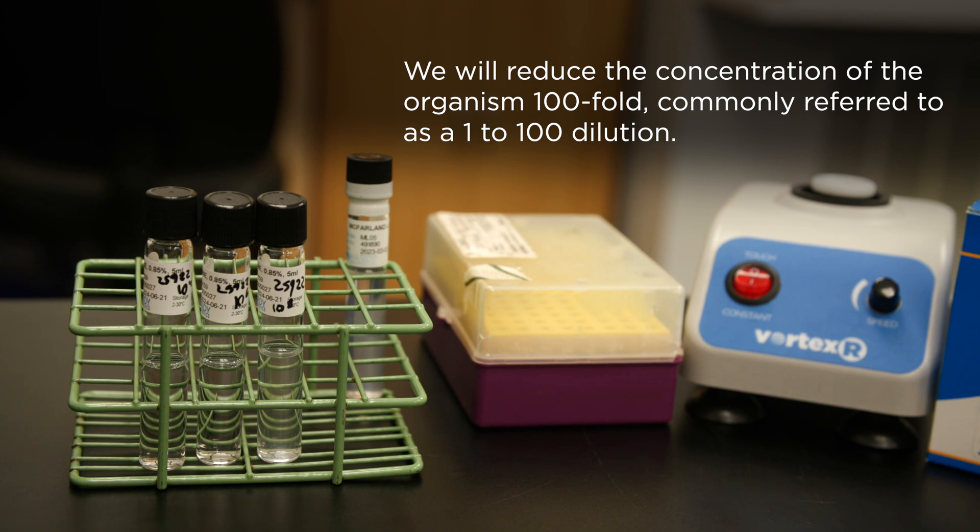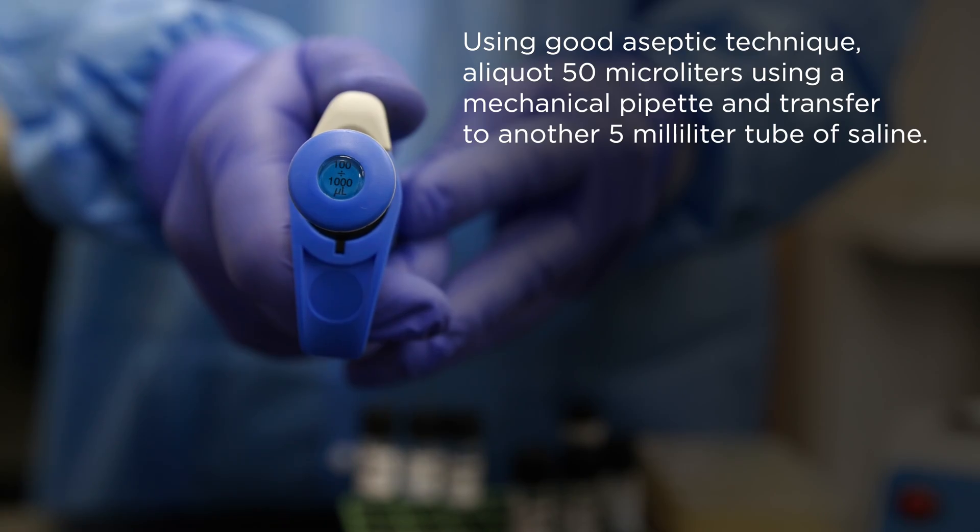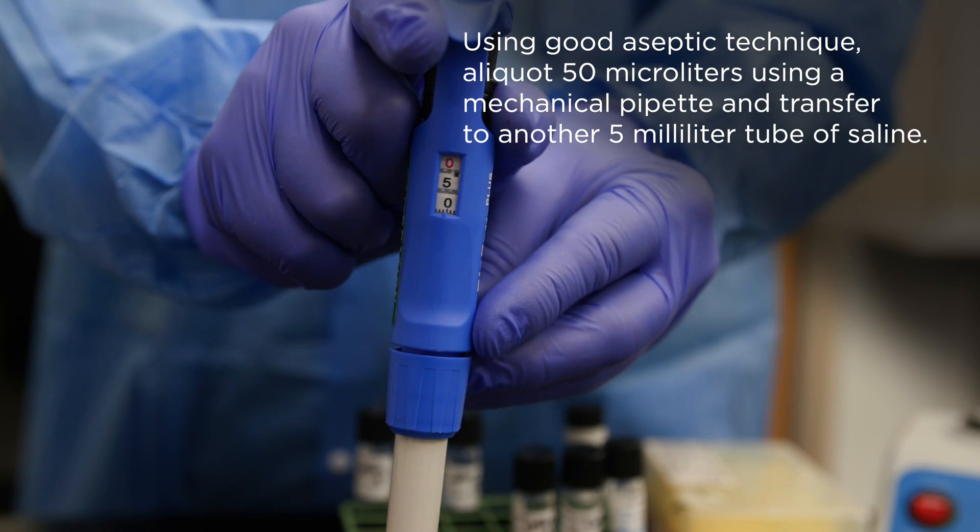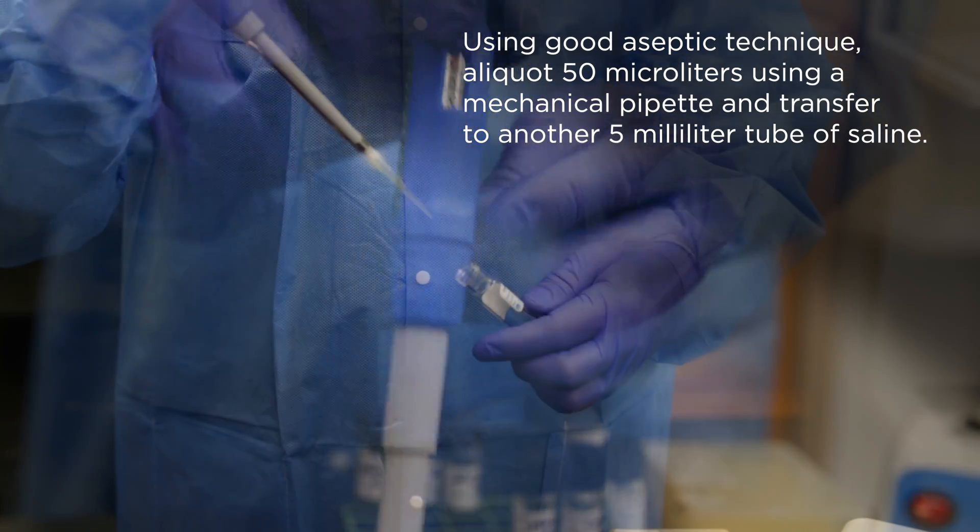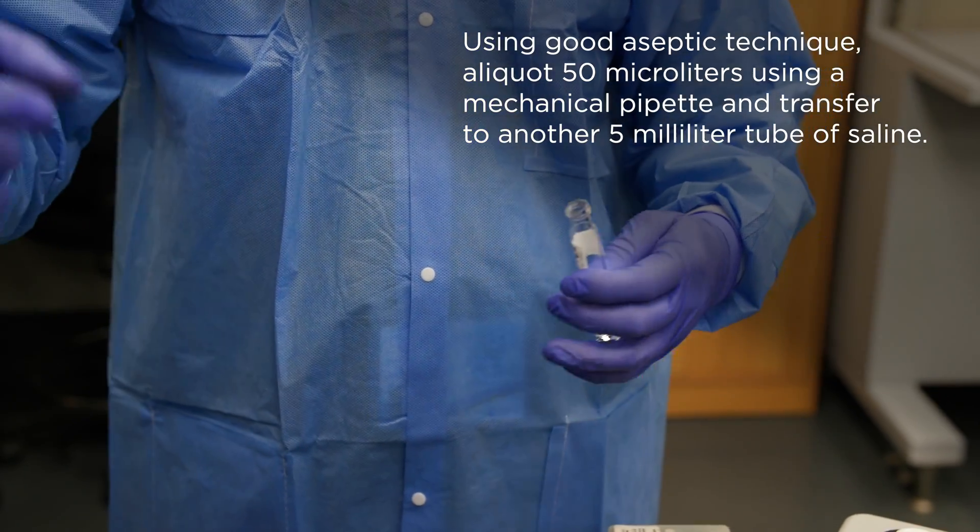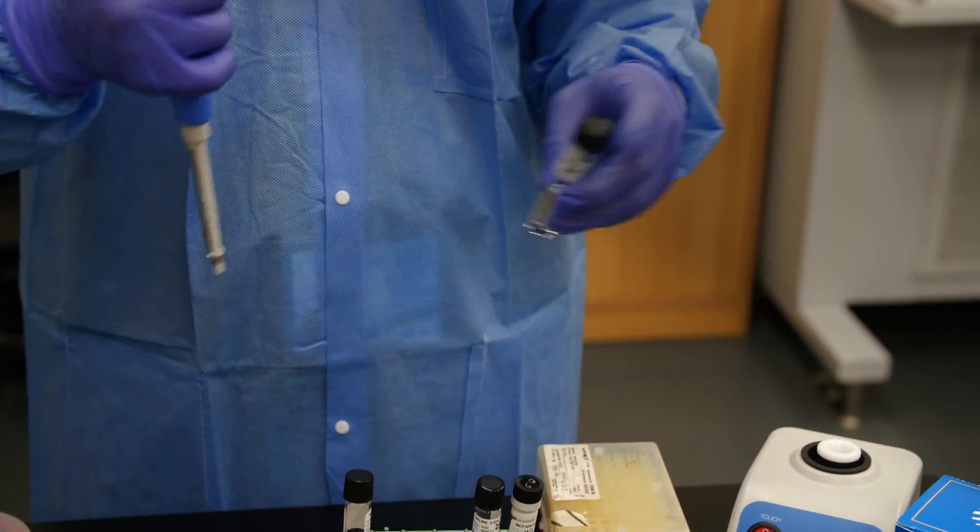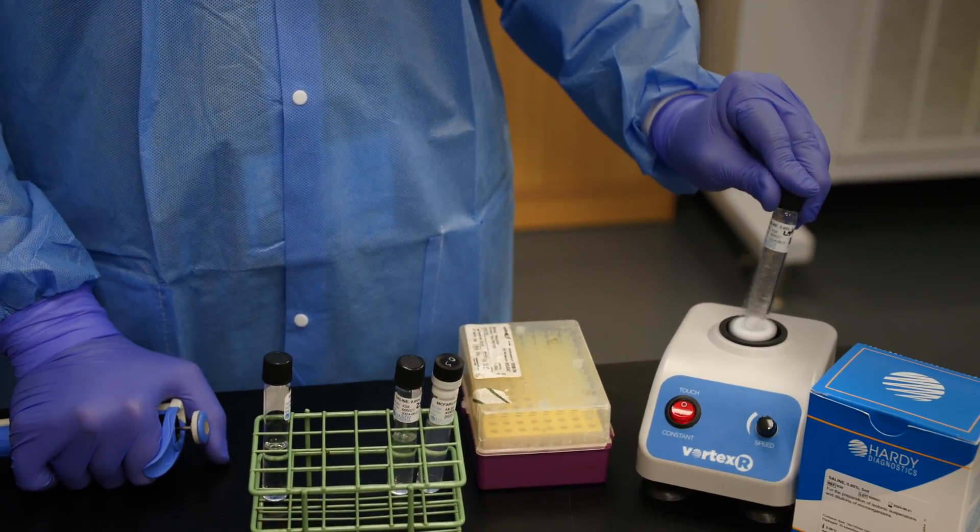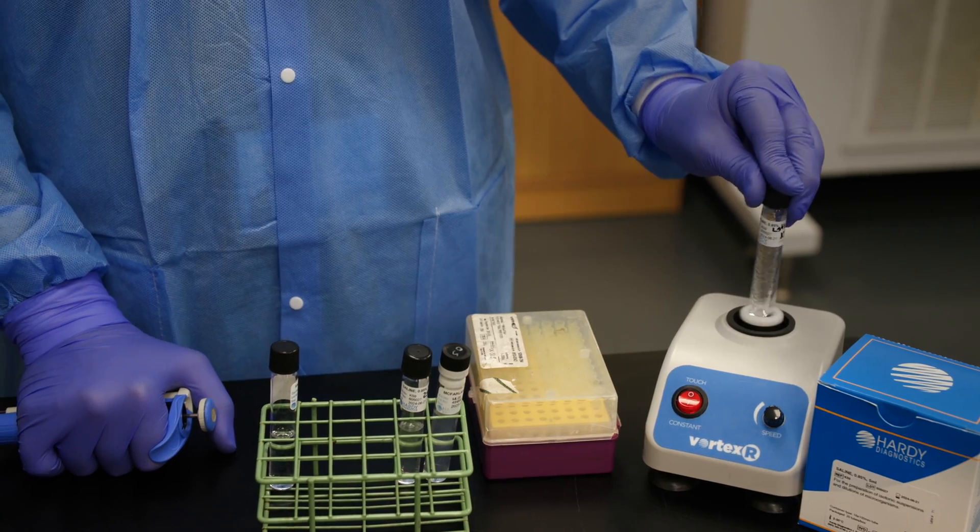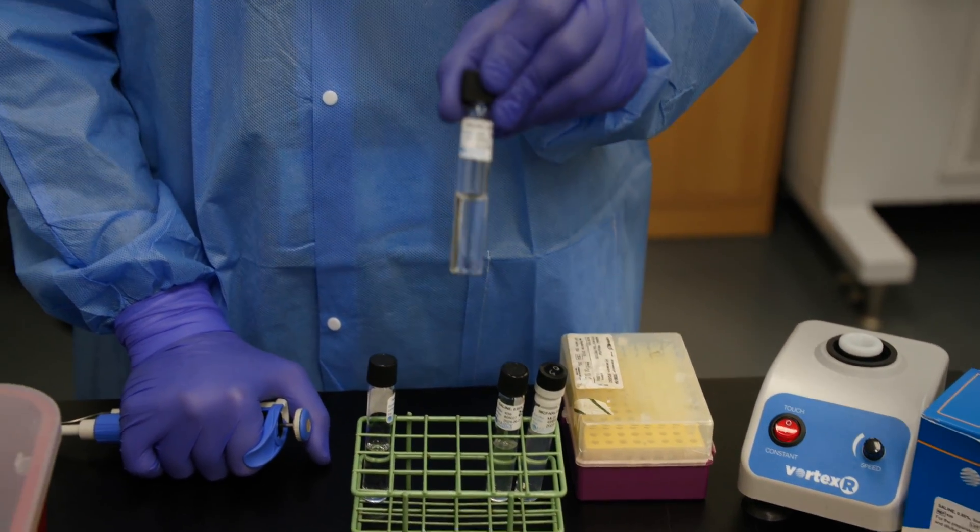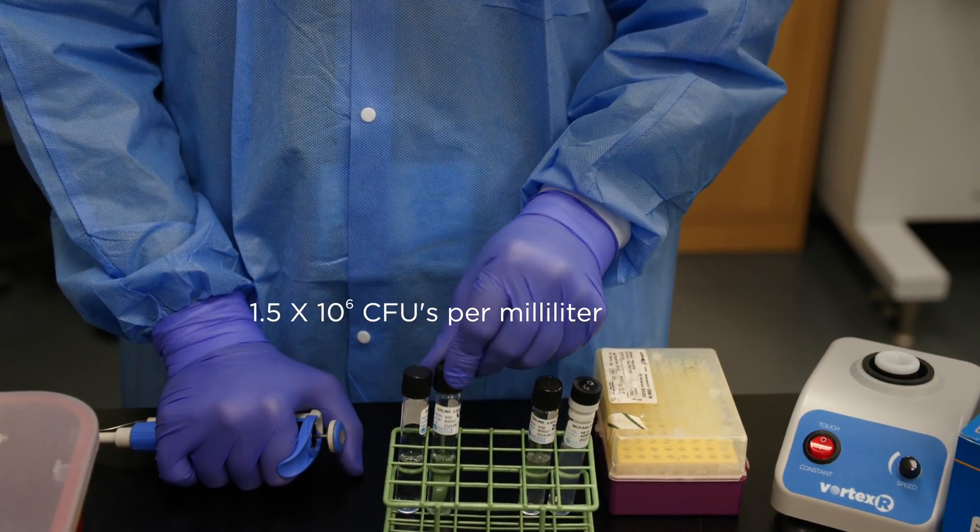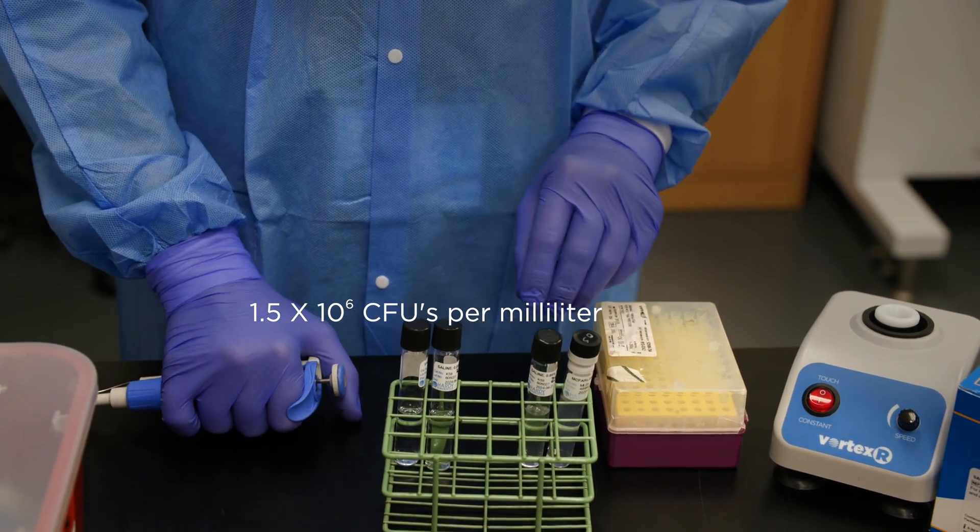We will reduce the concentration of the organism 100 fold, commonly referred to as a 1 to 100 dilution. Using good aseptic technique, aliquot 50 microliters using a mechanical pipette and transfer to another 5 milliliter tube of saline. Place the cap back on the tube and vortex to homogenize. The approximate concentration of the organism in this tube is now 1.5 times 10 to the 6 CFUs per milliliter.